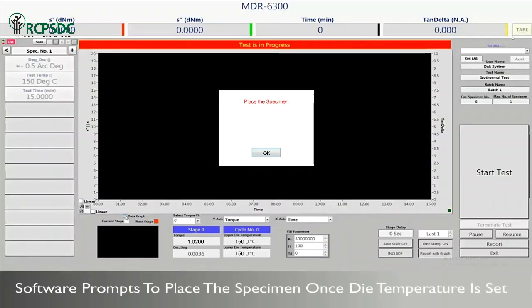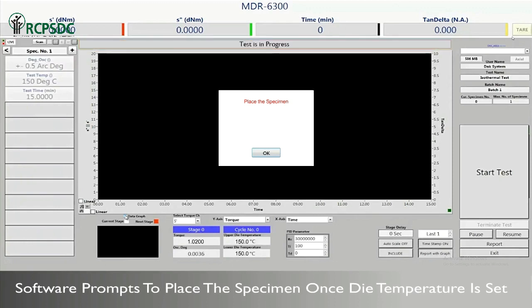Once correct pressure and die temperature is achieved, software will prompt you to place the test specimen for testing.